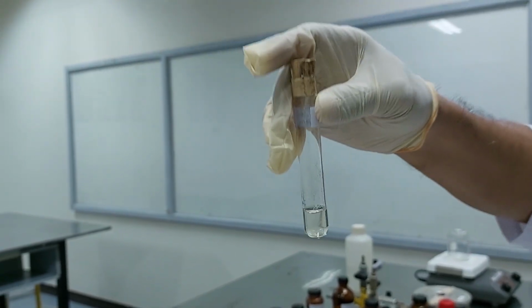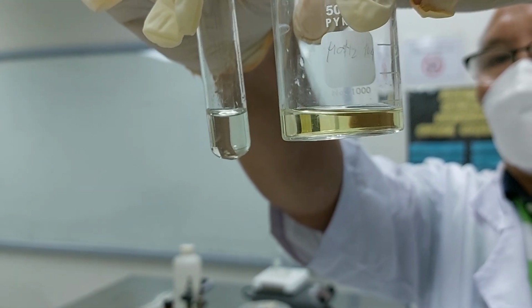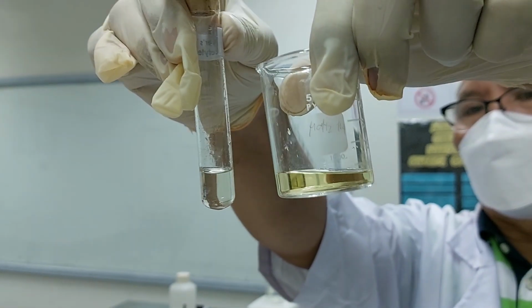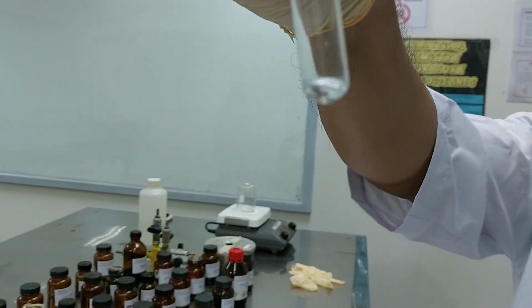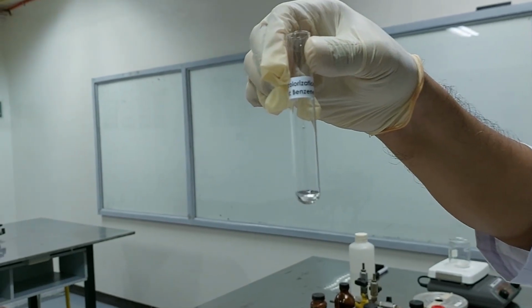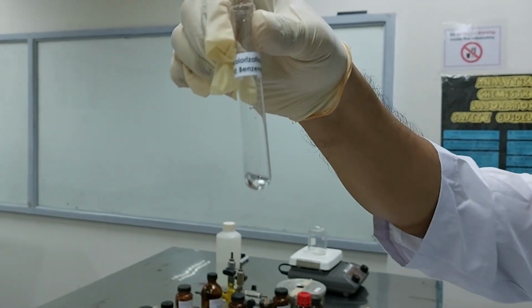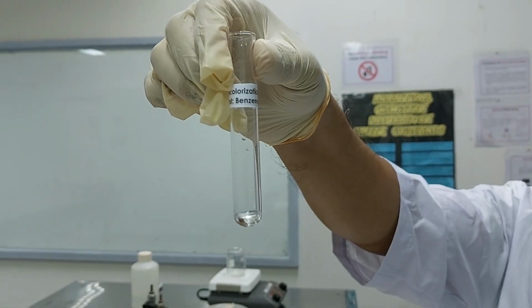If you compare that with this one, you could see the difference, right? The color of bromine disappeared, meaning it has reacted with acetylene gas. So let's compare this with aromatic. This is benzene, so let's see if we add bromine, if there will be a change in color.